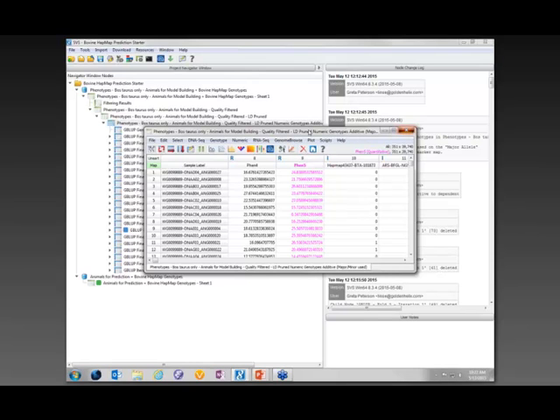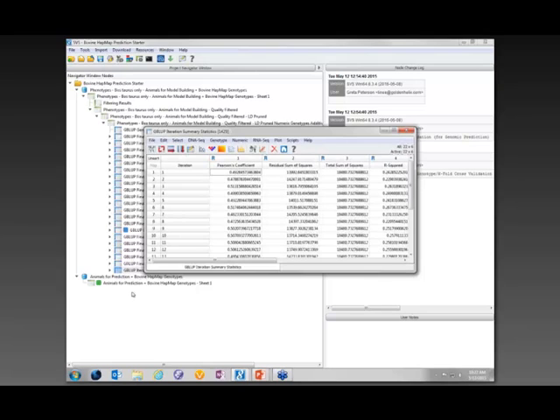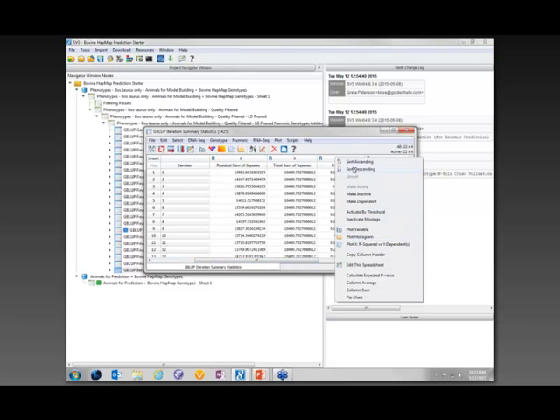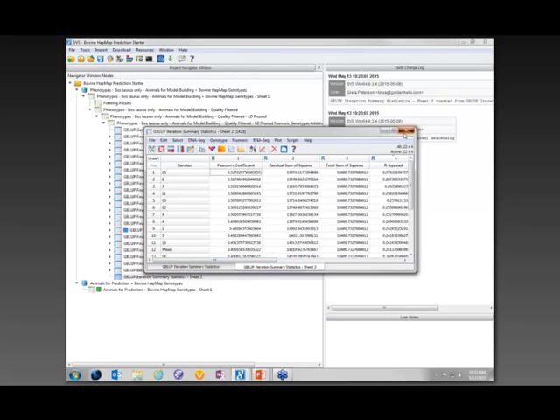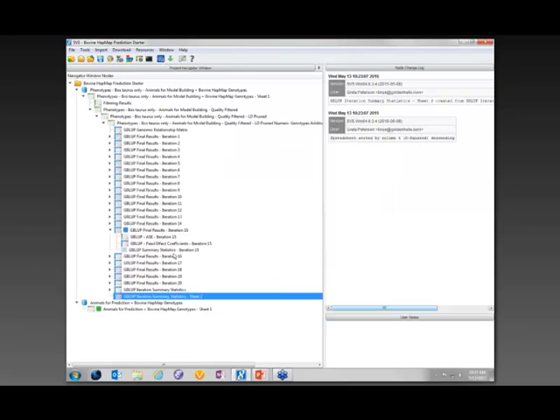All right, so we've already run k-fold cross-validation. Now we need to decide which iteration we want to use to predict our new genotypes. So again, I'm going to prefer the R-squared value, and I can sort this in descending order. And by doing that, I can see that iteration 15 has an R-squared value of 0.276. So we will go ahead and use iteration 15. As you can see, I already have this marked blue. So let me just expand that.